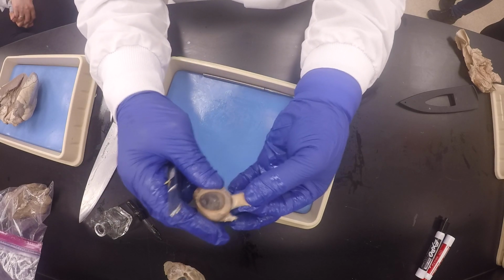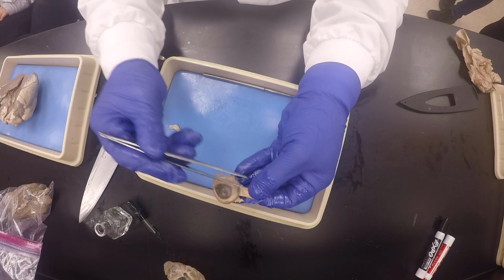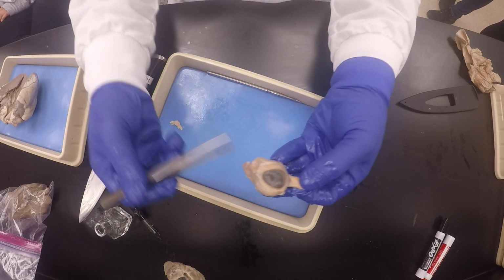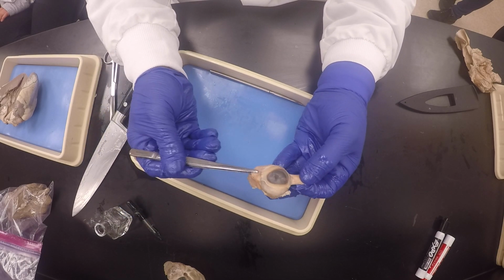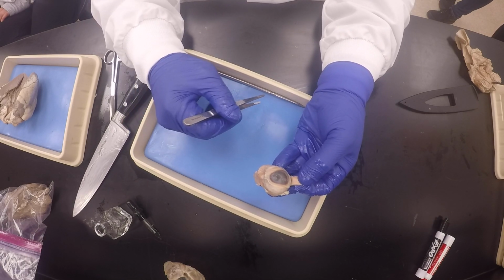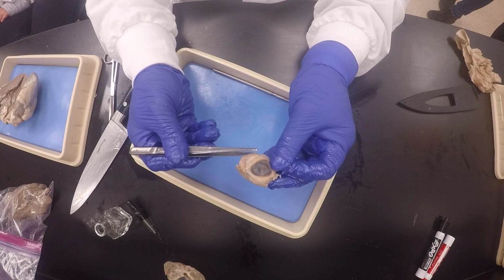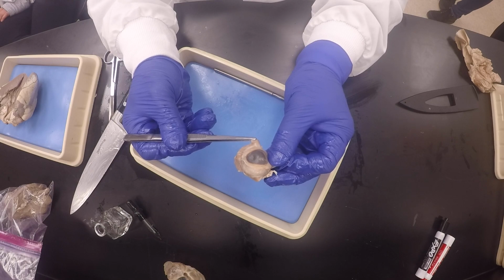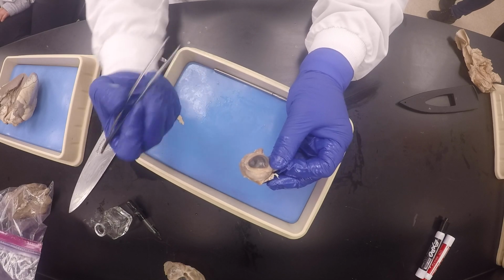So you know this one with the one muscle on the compass point is the medial side. You understand? So if this is the medial side, then by default the other short side has to be the lateral side. Again, the lateral side will have the compass point muscle, which will be the lateral rectus, and then the angle muscle, which points towards one long side, which will be the inferior oblique. So the inferior oblique points towards this long side, which is inferior, and you confirm it's the inferior side because you only see one compass point muscle, which is the inferior rectus. Okay? So then you go to the other long side and you say, what? If this is the inferior side, then that one has got to be the superior side.